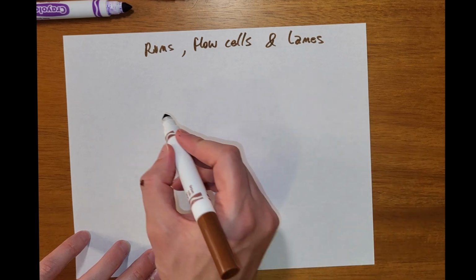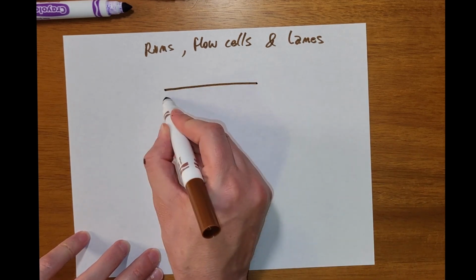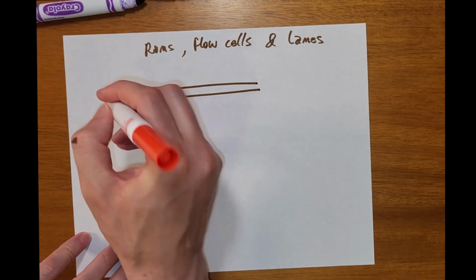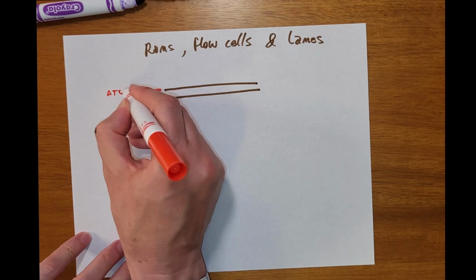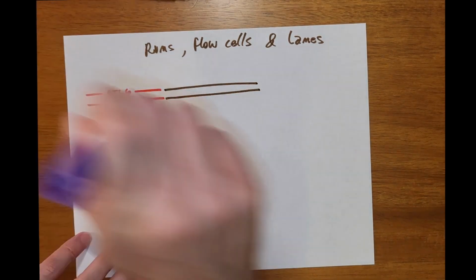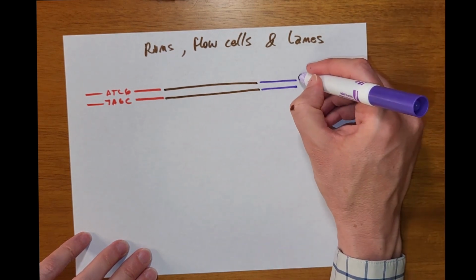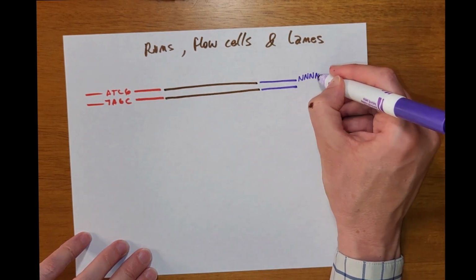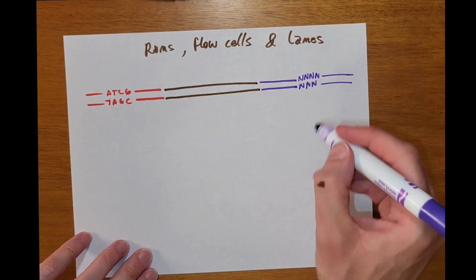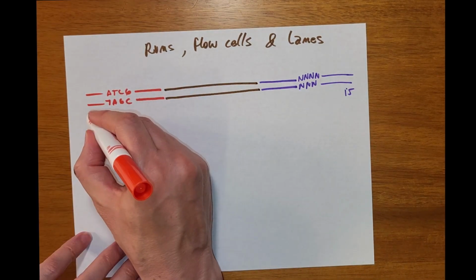So imagine that we design our PCR amplification strategy so that we have the barcode on the I7, and this can be, I don't know, ATCG, and the reverse complementary. And then we incorporate the UMIs on the other side. This is the same sort of concept. The UMIs are incorporated right in the middle of the read, and that will be important for what I'm going to explain in one second. So you have the I5 and you have the I7.